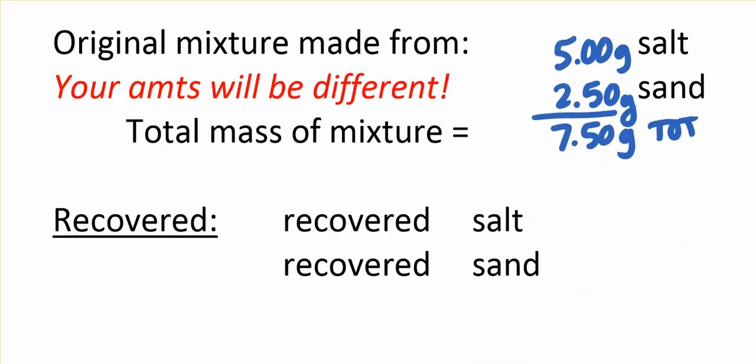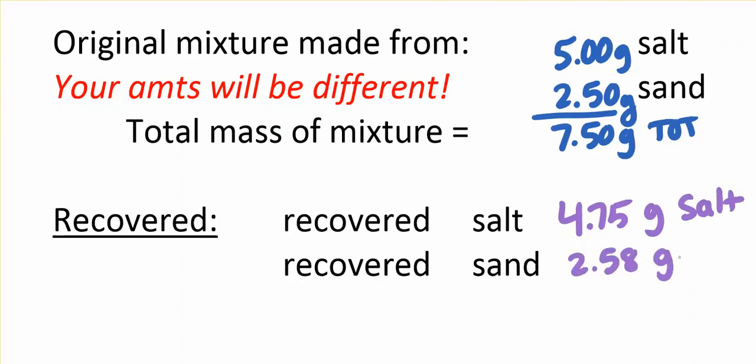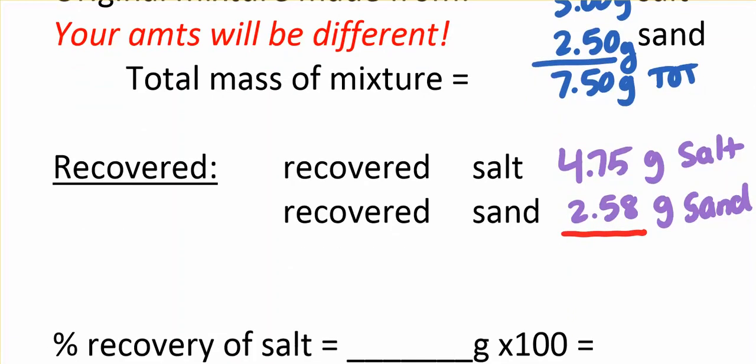That's how we started, and then we did our procedure and we ended up with a beaker of sand and a beaker of salt, and we're going to weigh those and see how much we get. So let's just say that we recover these amounts, and let's go ahead and add those together to see how much we recovered overall, or the total recovery.